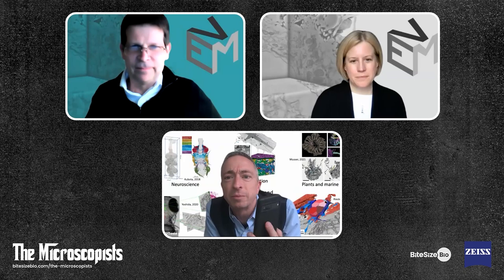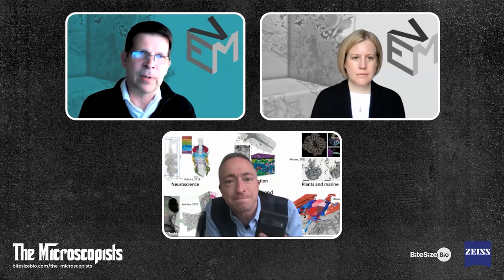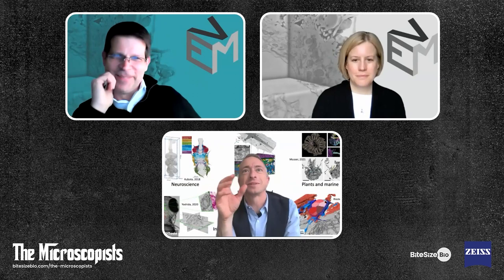And so I'm just thinking, my phone's camera is not going to take a picture of this, is it? And if you think about the chip size in this, the chip is tiny. The chip that you're looking at is almost as big as it's huge, isn't it? That's part of the driver of the cost. The more expensive chips to be able to collect the signals from the electron beam. Smaller chips are less expensive, and of course, in the phone, the quality is a little different too. And the sensitivity is markedly different for electrons, yes.